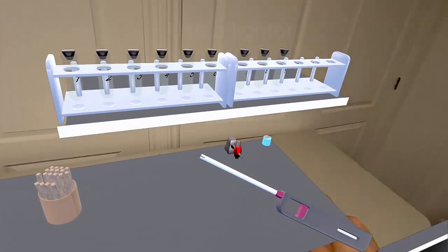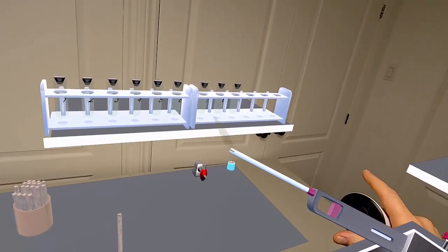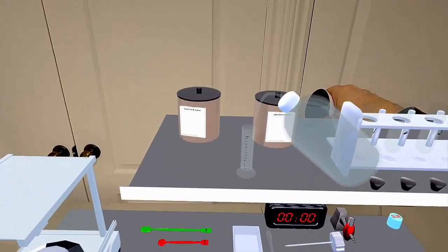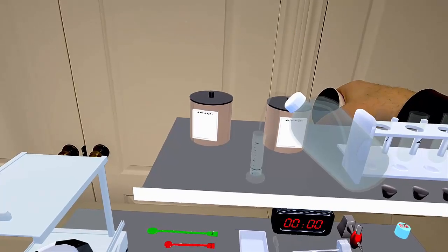Same principle to use the lighter. Grab the lighter and press the trigger button to light the flame. Finally, if you use the wash bottle, first grab it, then press and release the trigger button to release the water from the bottle.